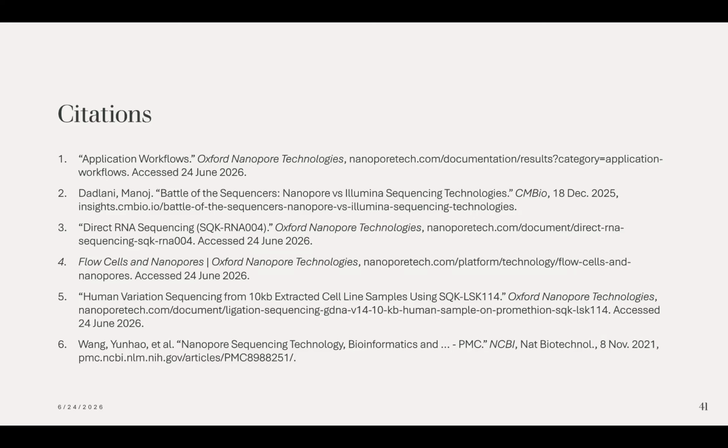Yeah, thank you. That's a great question. So I'm not actually aware of how much it would cost to send out to a different company. Maybe you both would have a better perspective on that. I can say that for doing it yourself, a pack of 4 flow cells costs roughly $4,000. The reagents, the kits, have varying costs, but they're within the 700 to 1,000 range, I would say.